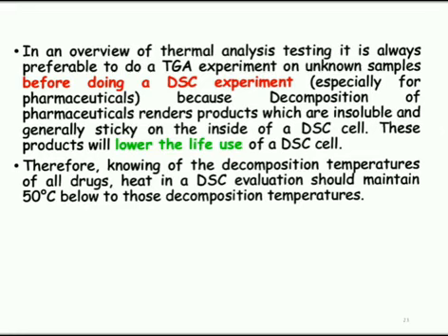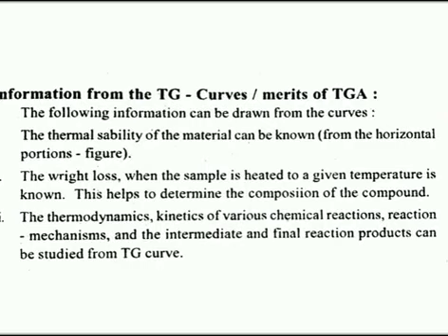So far we have discussed the characteristics of the thermogravimetric curve and the applications of thermogravimetric analysis. Now we shall discuss what information we are getting from the thermogravimetric curve and what the merits of TGA are. Here I have given some of the information obtained from the thermogravimetric curves.